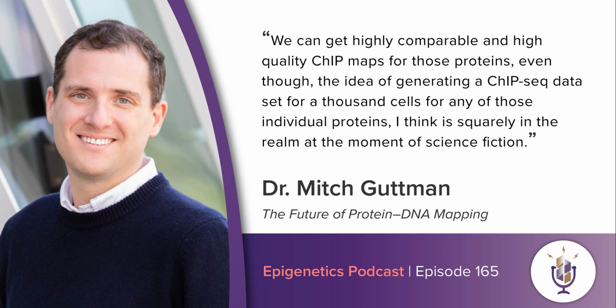So in your initial paper, the ChIP-DIP assay was performed on bulk samples, not single cells. So do you see this currently as a limitation? I mean, yes and no. Certainly it is a limitation. I think the real question is, for what specific questions and what specific goals. I think for most applications, ensemble mapping has proven to be very informative and will remain so.